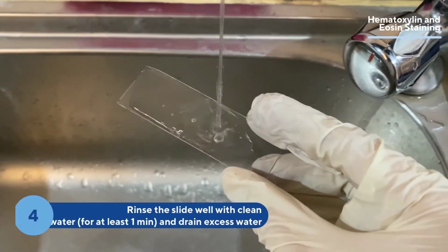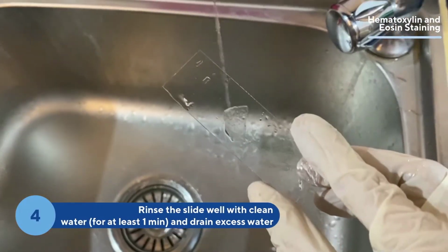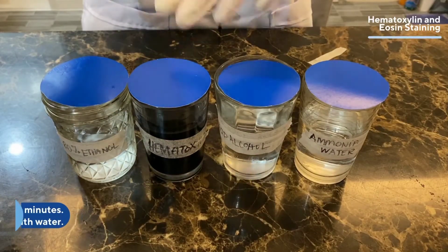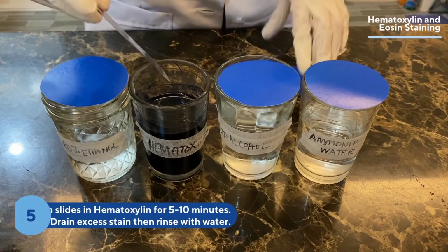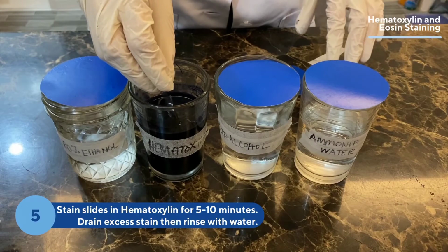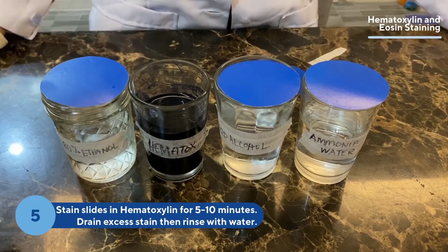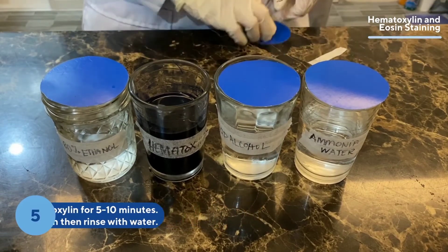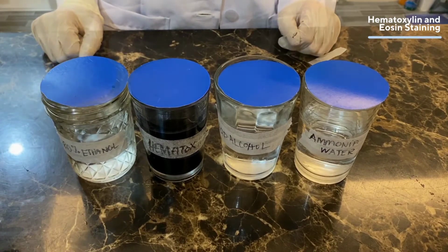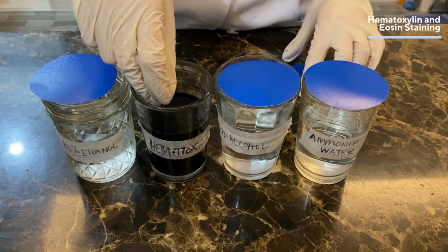Fourth, I will wash the slide well with clean water for at least 1 minute and make sure to drain excess water. Fifth, I will stain the slides in hematoxylin for 5 to 10 minutes. After 5 to 10 minutes, I will drain excess stain and then rinse it with water.